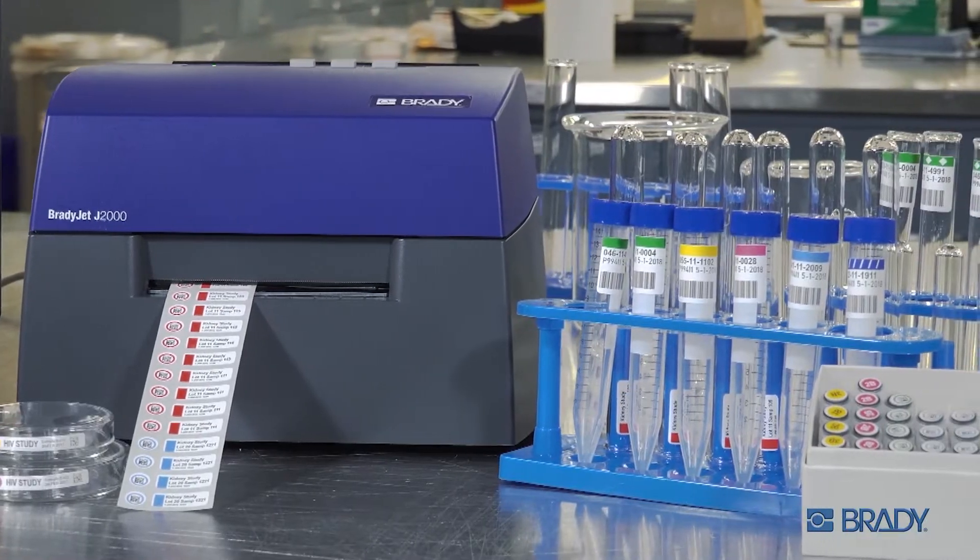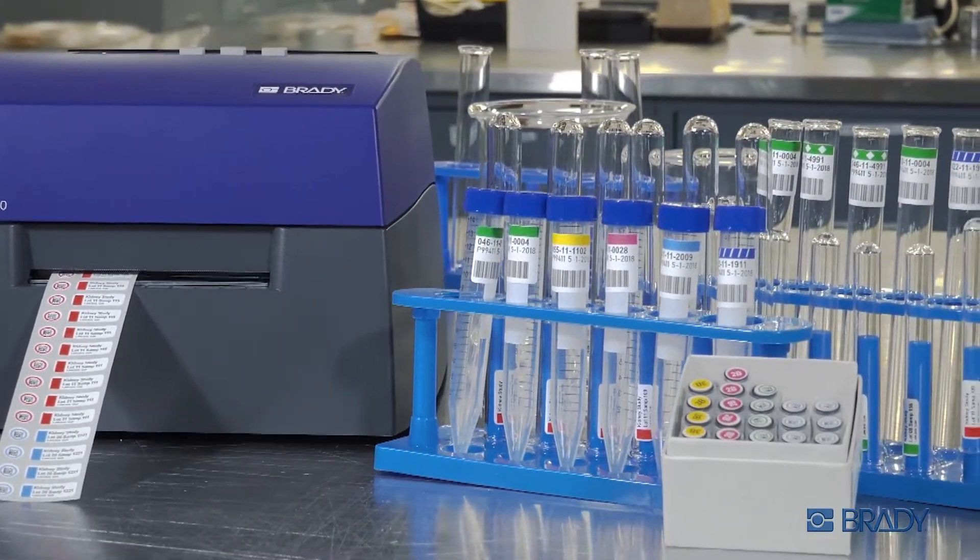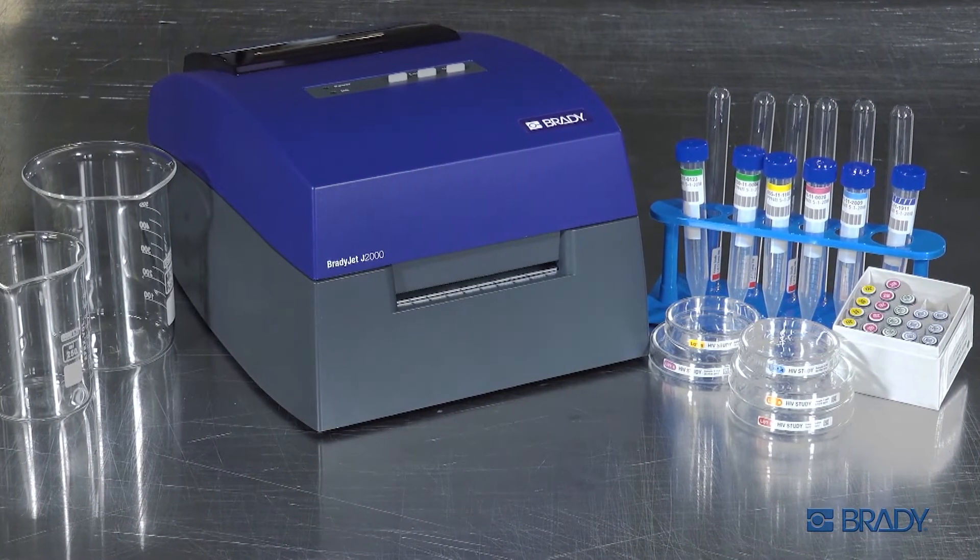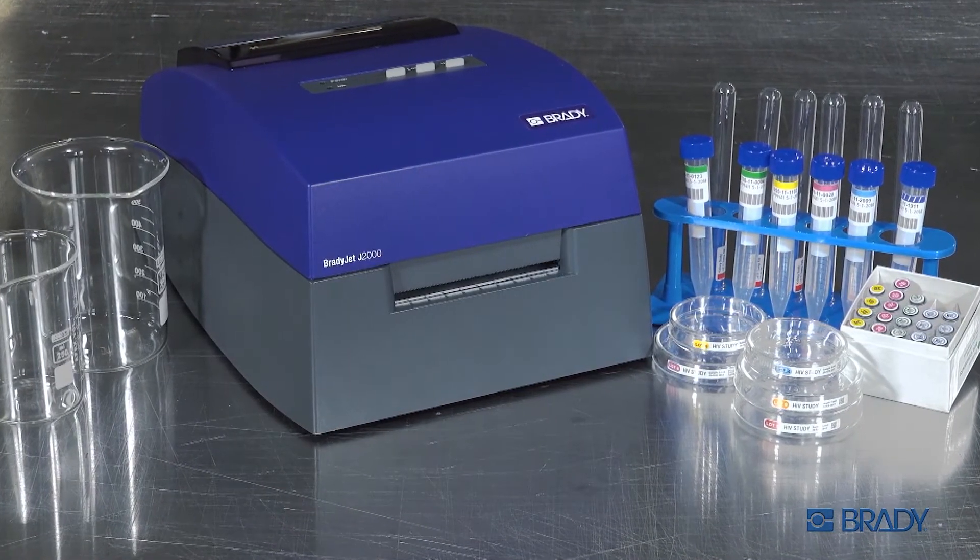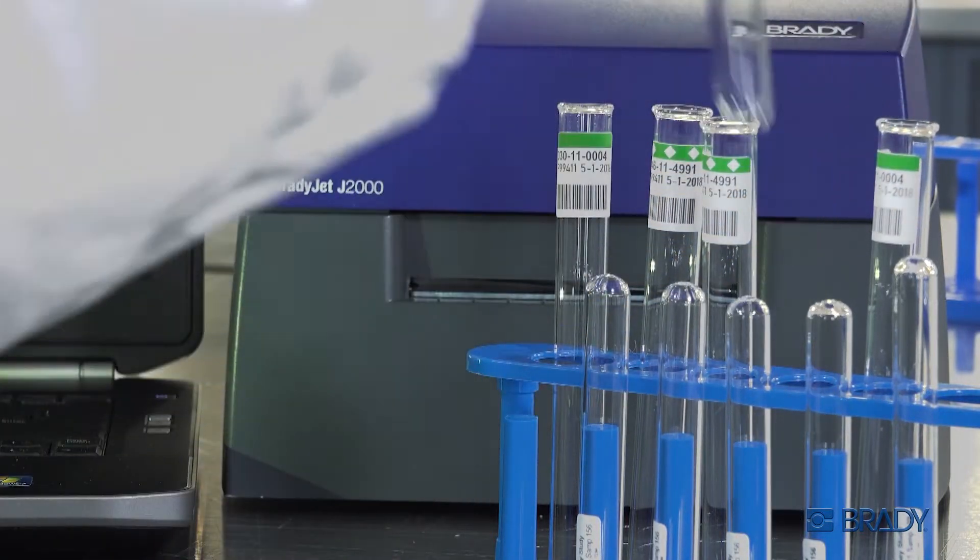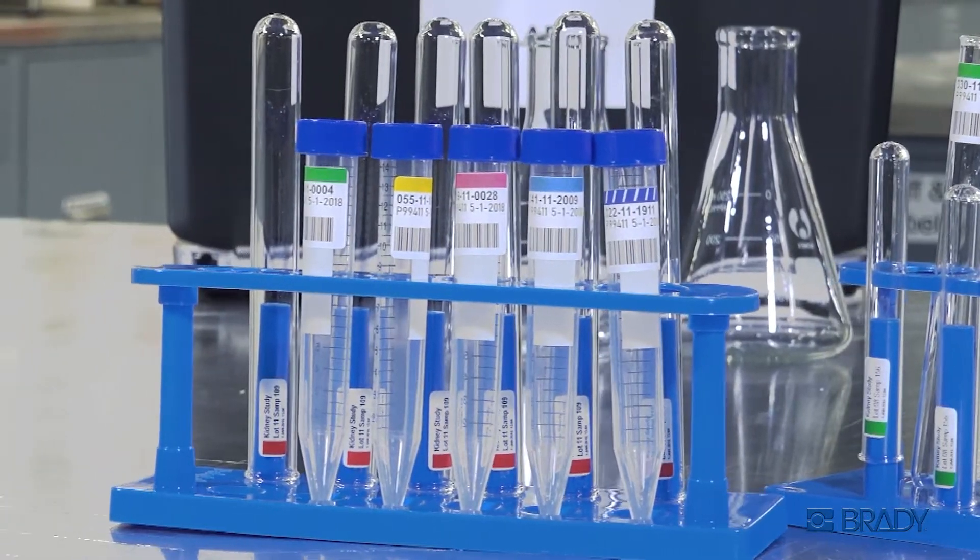Add the efficiency and accuracy of vibrant color labeling to your workflow with the BradyJet J2000 Color Label Printer. The human brain can recognize and categorize colors faster and with fewer errors than with alphanumeric characters alone.